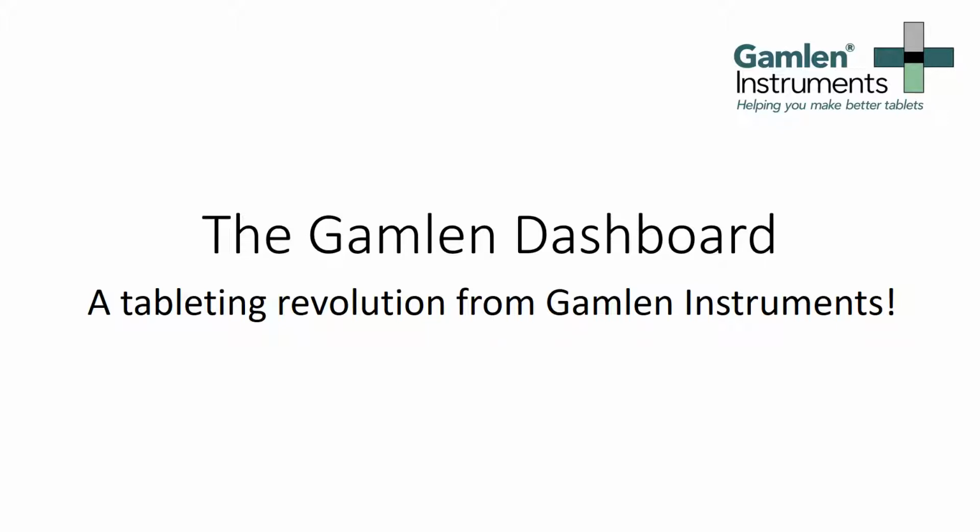The Gamlen Dashboard has been developed to work with the Gamlen D-Series Powder Compaction Analyzer, combined with the Gamlen Tablet Tensile Analyzer, a unique system for characterizing powders. The Gamlen Dashboard is used to visualize your data in real time. It brings together all of the tablet's data into a single manufacturability analysis and places the product on 8 critical quality attribute scales, which are the key to determining both product quality and the risk of product failure.